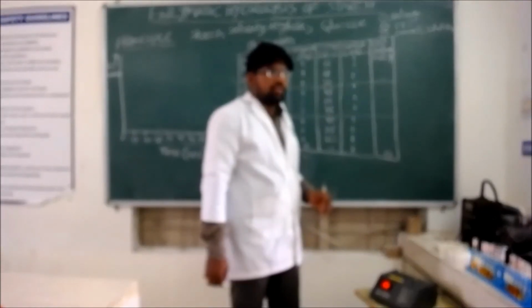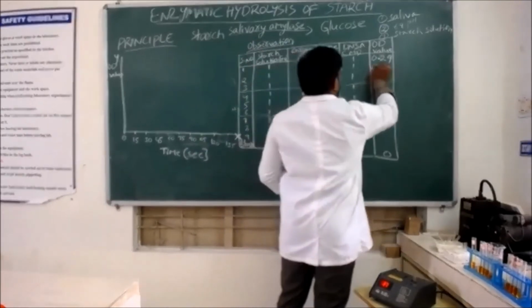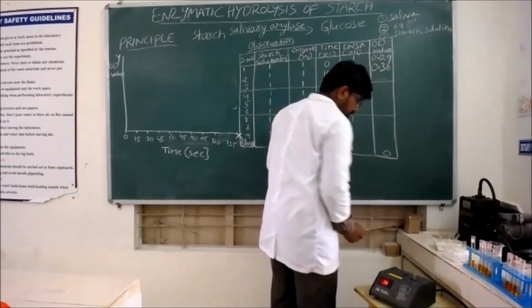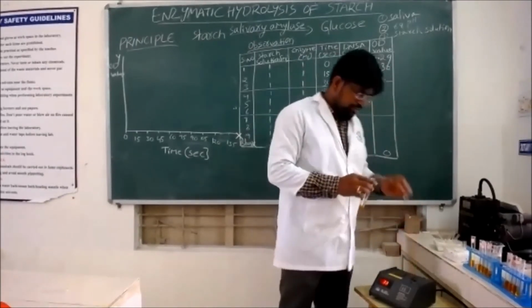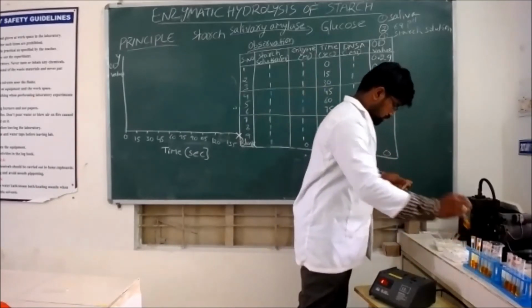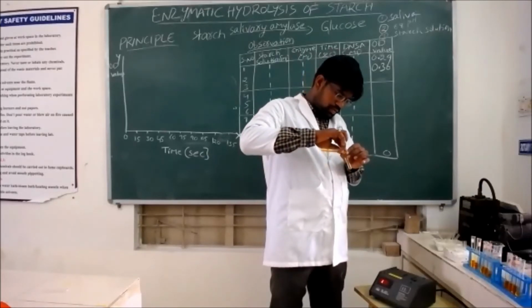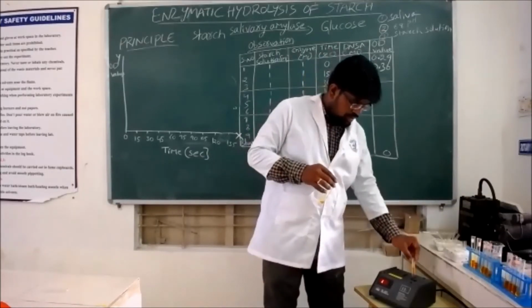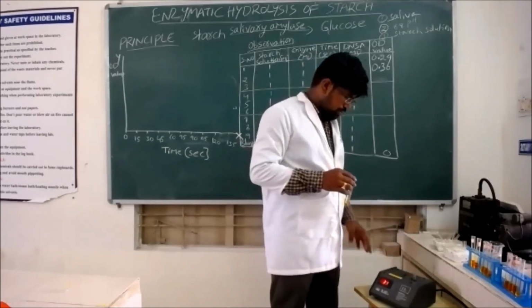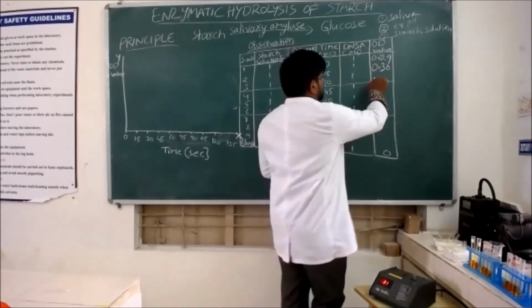The value is 0.36. Take the third tube. That is 0.37.